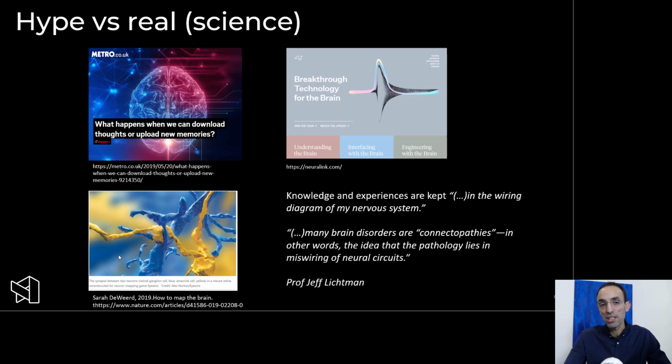And the idea here is, and Jeff Lichtman summarizes it in these two statements, and by the way, I recommend his TED Talk, is really amazing. Not only is he a great scientist, he's also a very good speaker. But he summarized in these two statements here.